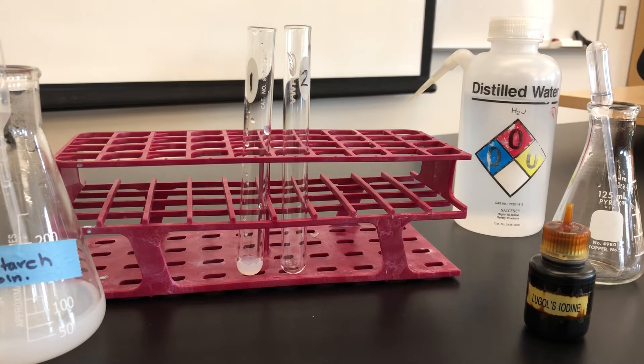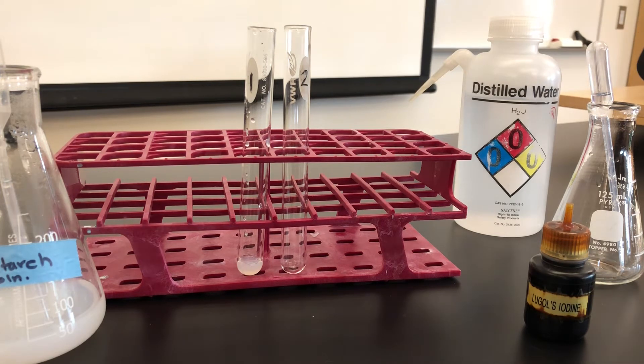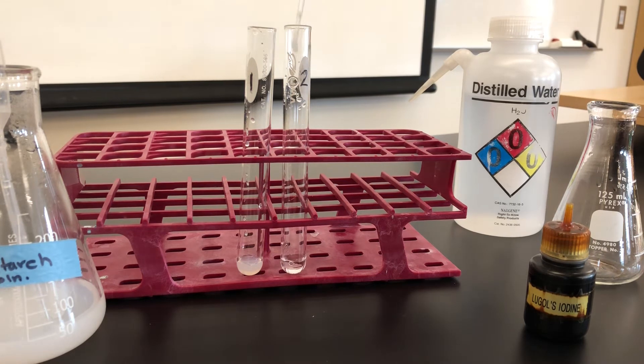It asks you what would we use for the control in test tube 2. In this case, and in most cases, we use distilled water. So we're going to add 1 ml of distilled water to test tube 2.